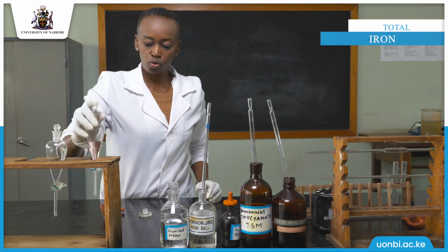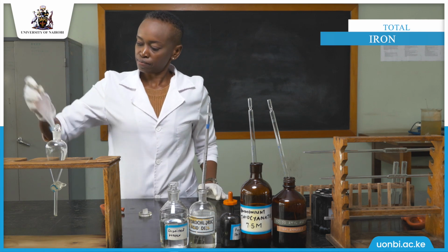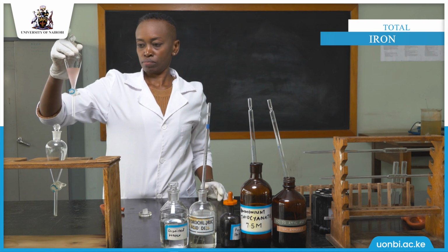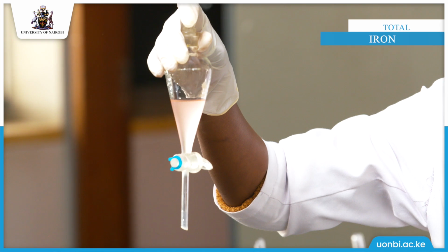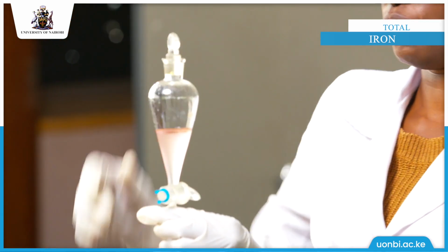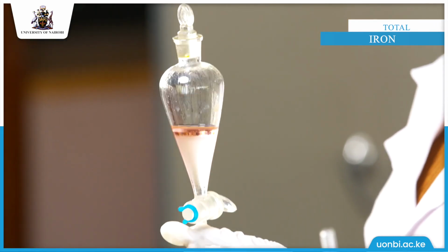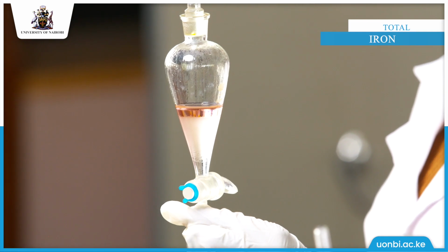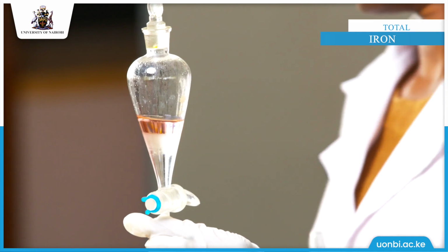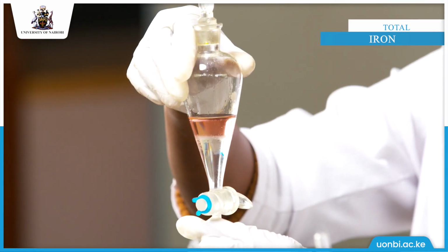Then we are supposed to thoroughly mix the content. After that, 2 layers will form. We are supposed to discard the lower part and remain with the upper part, which has the iron concentration.